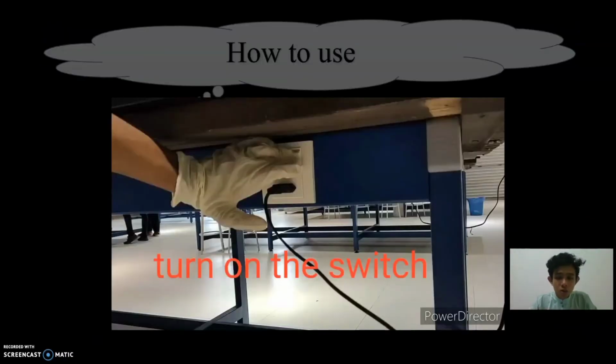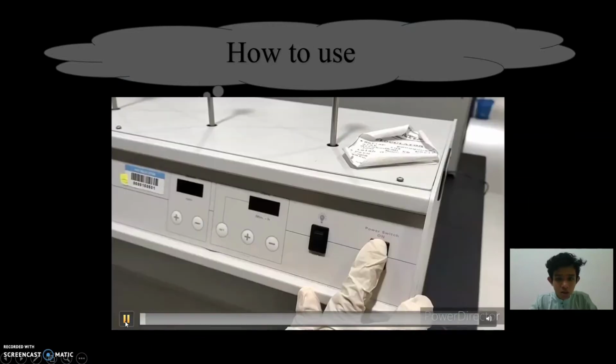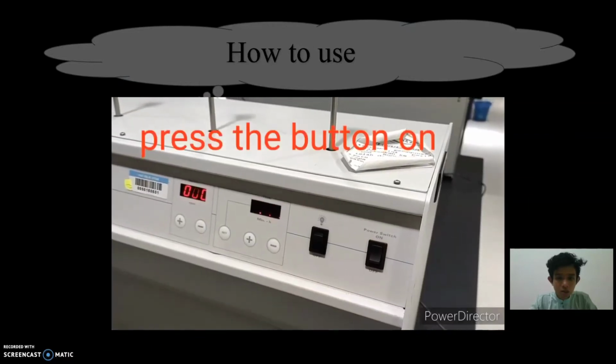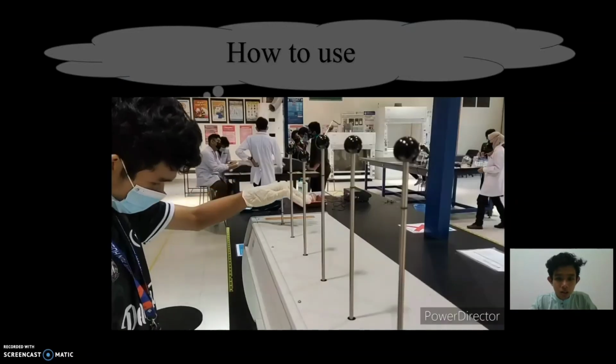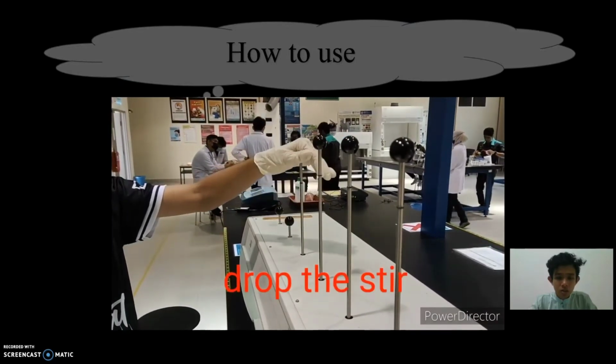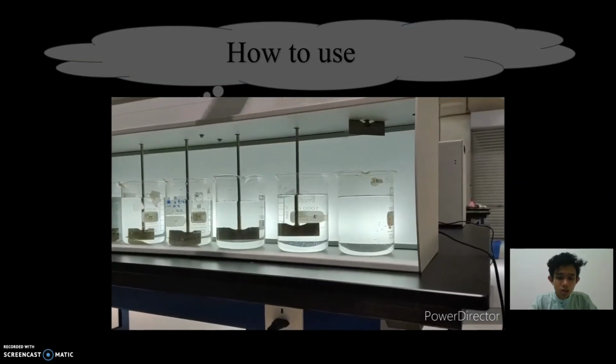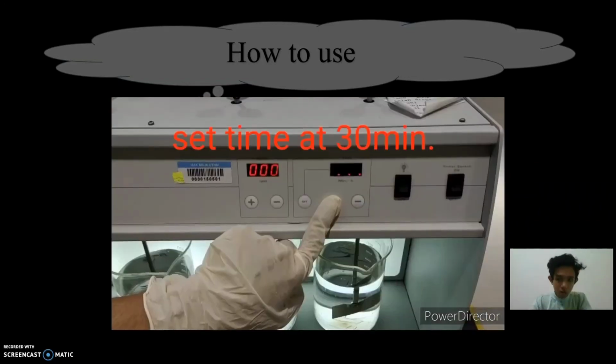Okay, I will show you the video of how to use the jar tester. First of all, we have to turn on the switch and then press the button on, press the button light, and we have to drop the stirrer, so we can see that the stirrer has dropped.